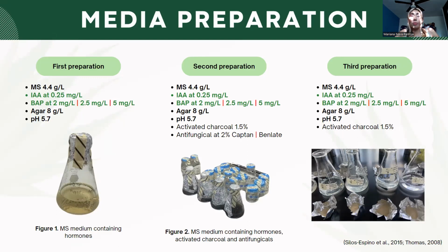For the fourth methodology, which will be our final methodology, we decided to first cultivate the explants using the third methodology with activated charcoal, and then we subcultured it to the first media preparation without activated charcoal.